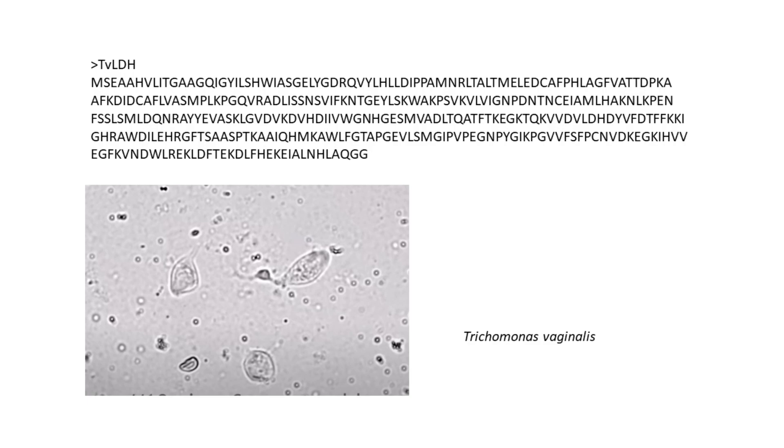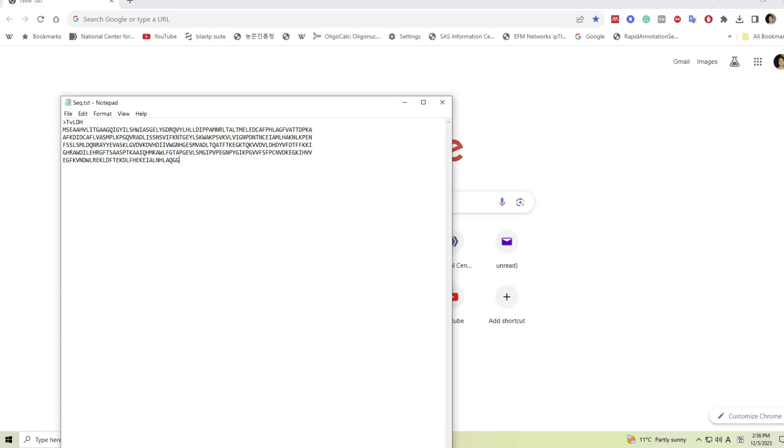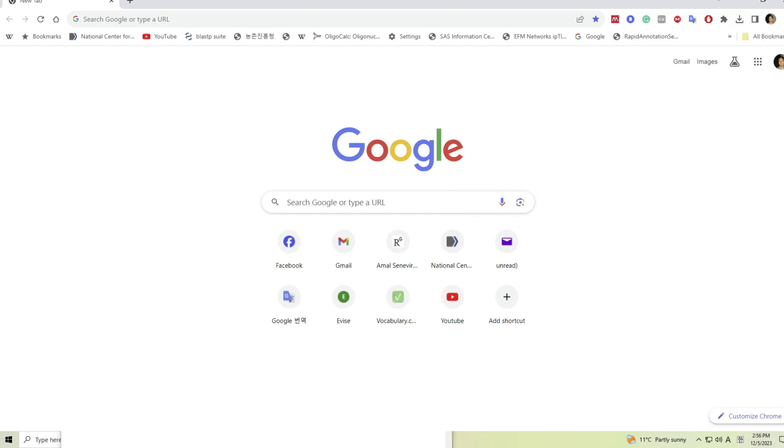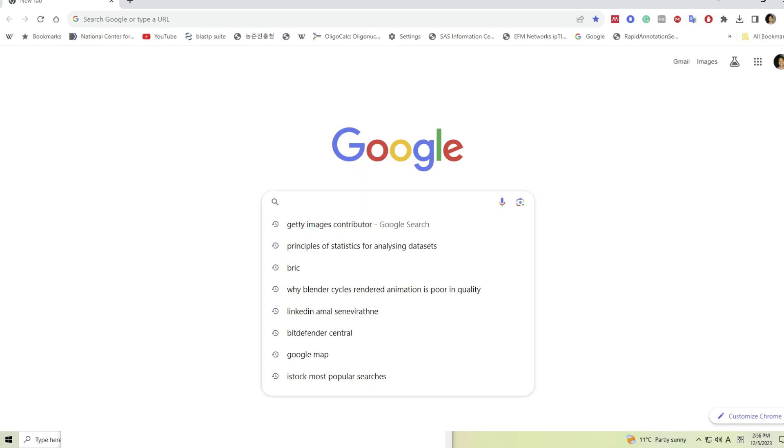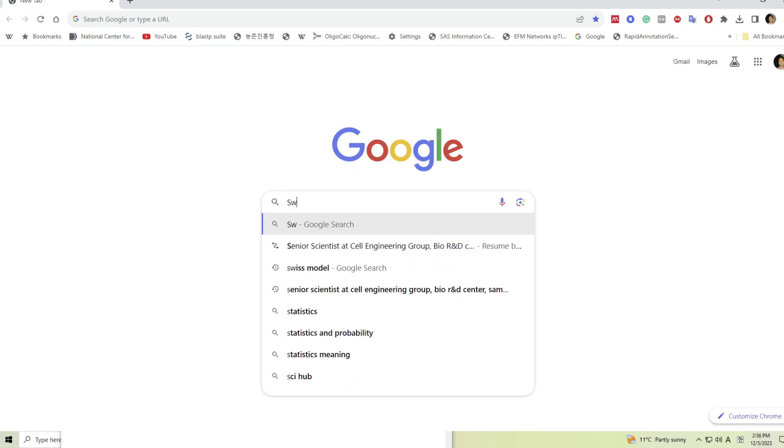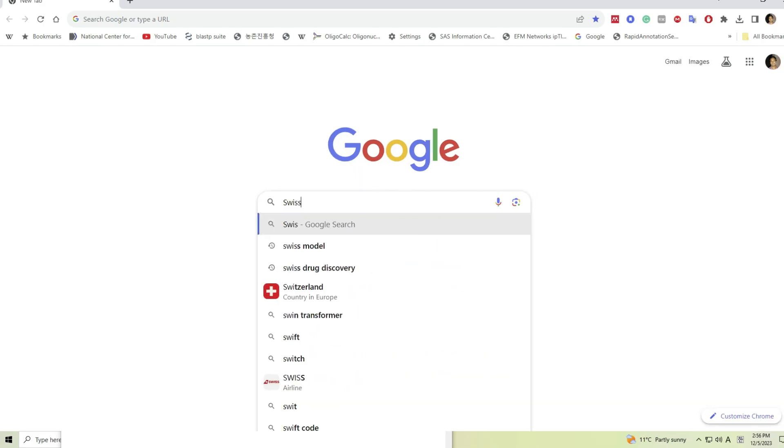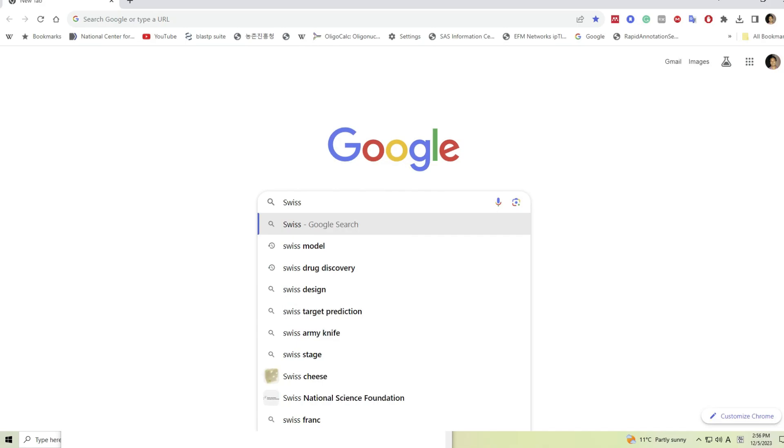For this tutorial I will use a protein sequence that I will represent as TVLDH, which is lactate dehydrogenase enzyme found in Trichomonas vaginalis. This protein is 335 amino acids long. Let's start our work. If you search SWISS-MODEL in the search engine, you will be directed to this page and click on SWISS-MODEL link.